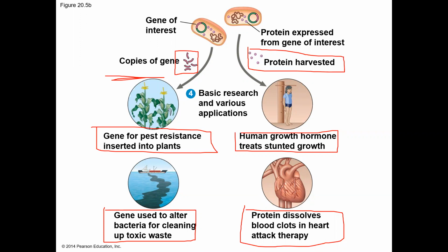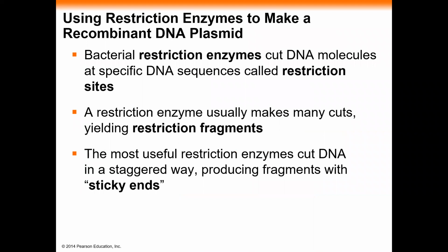So again, as we've said, bacterial restriction enzymes, again, these were discovered, and these are produced by bacteria to cut up DNA. We're going to talk, I think, let me check here.